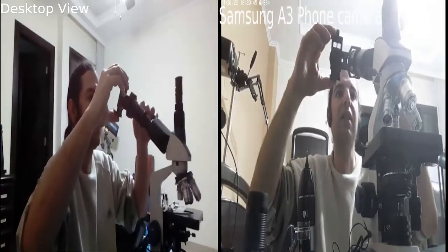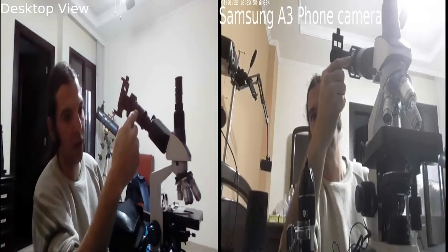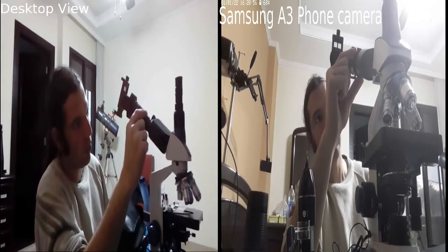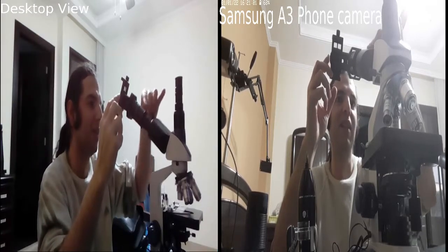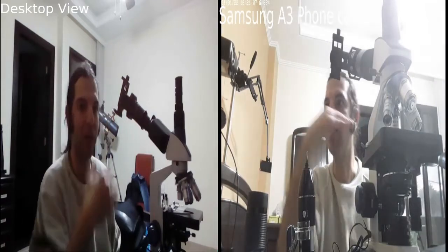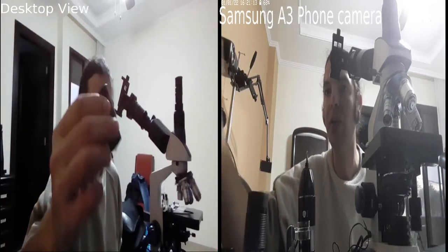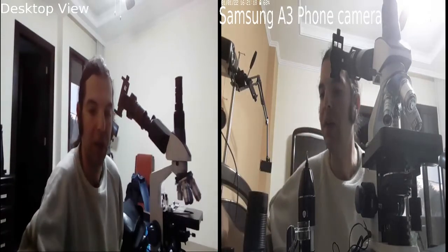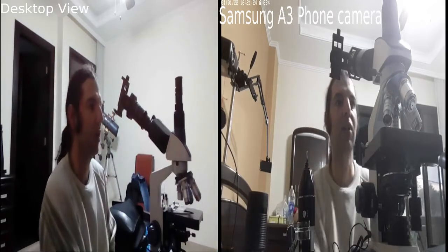I'll have to fasten it so you can see the complete view of it. Remember, this has no screw over here. See here inside, it has no screw. It holds, but this way I can hold it. By the way, I am discovering this now, so I can hold the mobile phone in a horizontal way, because this does not move. If I use the eyepieces that come with the microscope, they rotate in their place in the shaft of the eyepieces. They don't have a screw, and this is something that should have been there.